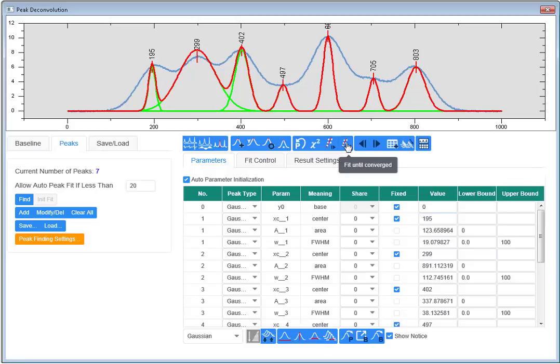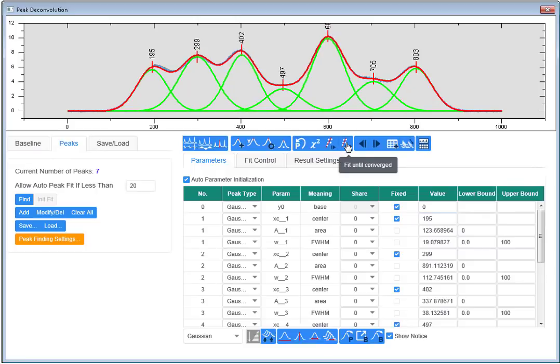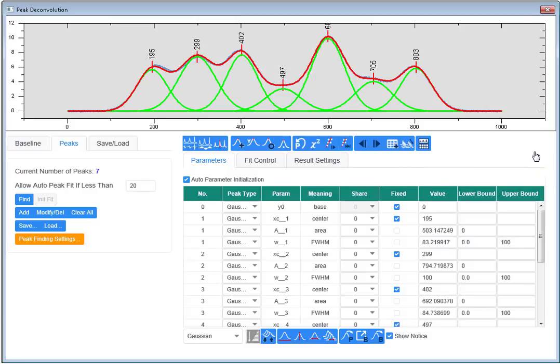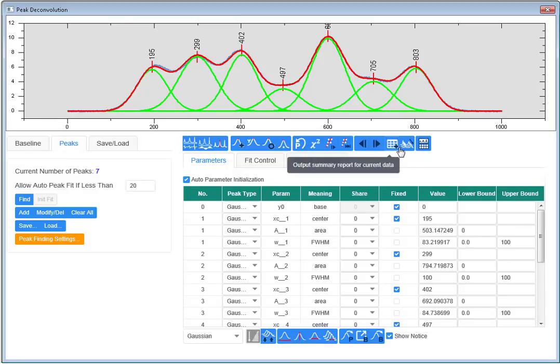Now I'm ready to perform the fit. I notice that the fit converges and the tolerance was met. There are several options for output. I can output a summary for the current data. I can as well perform batch peak fitting with these settings to multiple columns in the same worksheet.